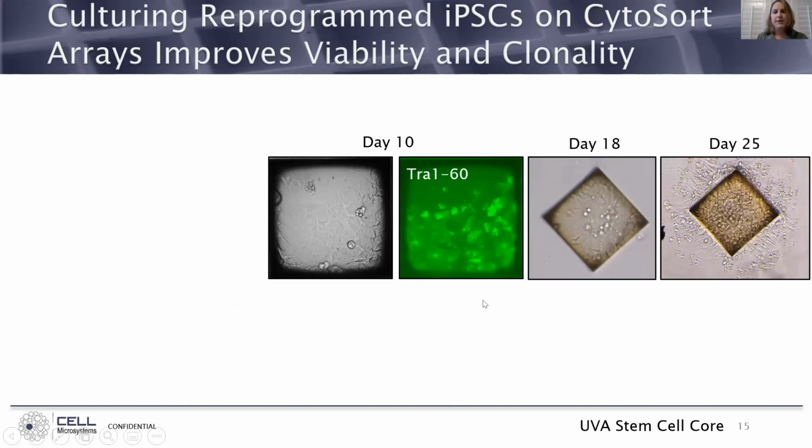In contrast, when the workflow was performed on the AIR system, it was much more streamlined and much more amenable to user interaction.